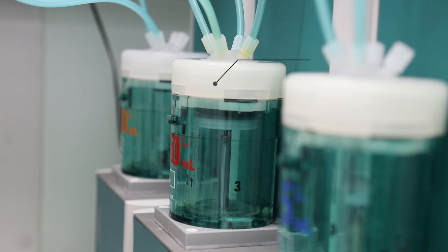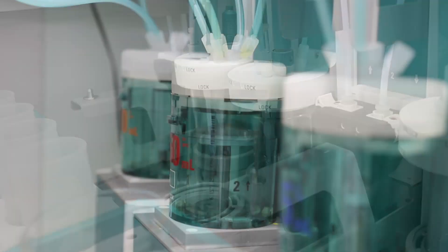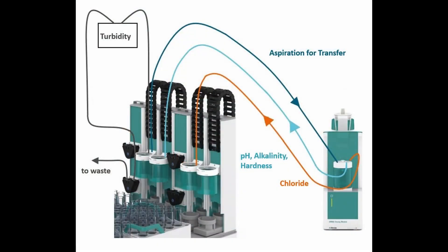The sample transfer to further workstations is carried out by a cylinder unit. First, all components are pre-rinsed with an aliquot of sample solution to prepare them for the final sample transfer. Before the sample is transferred, the titration beakers are cleaned to avoid any cross-contamination between the samples.